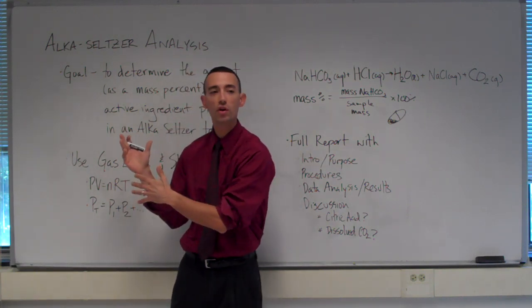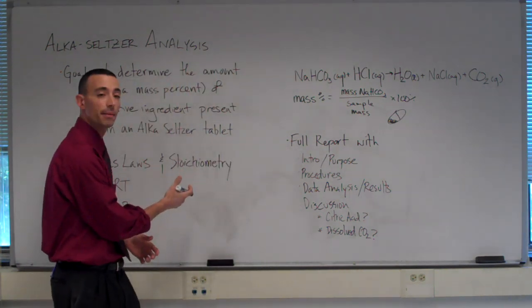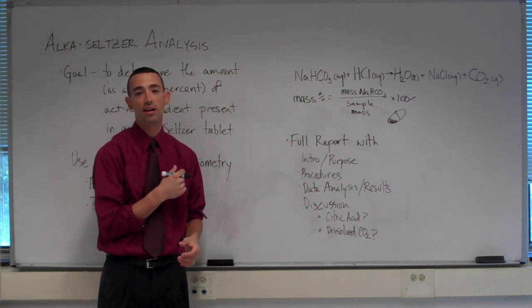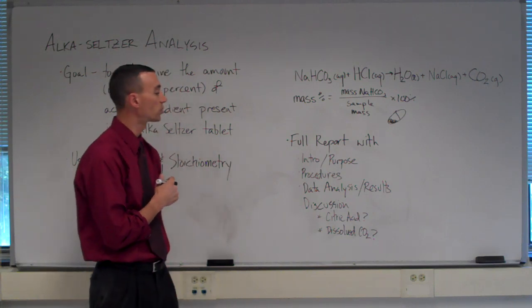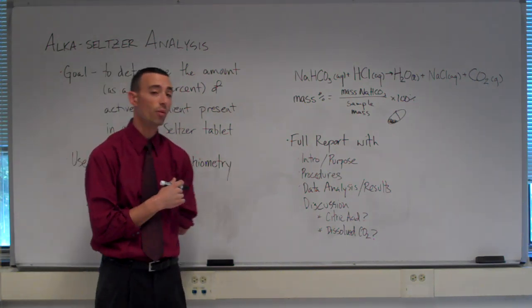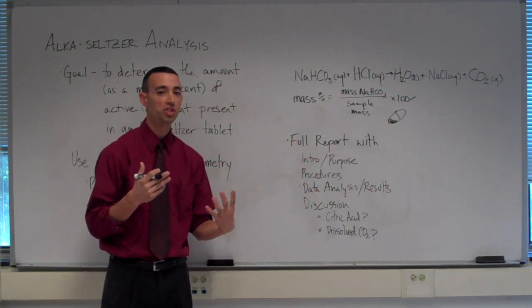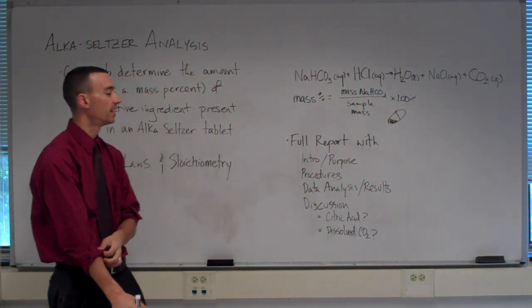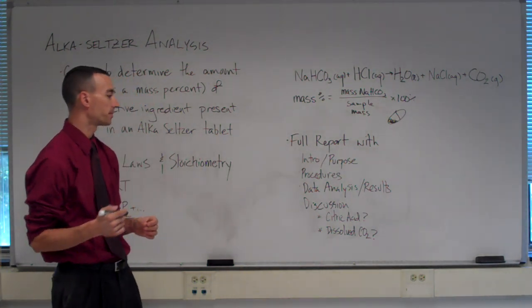We've already gone over the goal, and we're using gas law and stoichiometry concepts to analyze that Alka Seltzer sodium bicarbonate content. So that's, in a nutshell, your intro and purpose for today. If you wanted to provide some extra information about acids in general, that's always appreciated and great to show that you've gone that extra mile to learn a little bit, provide some background on your topic.